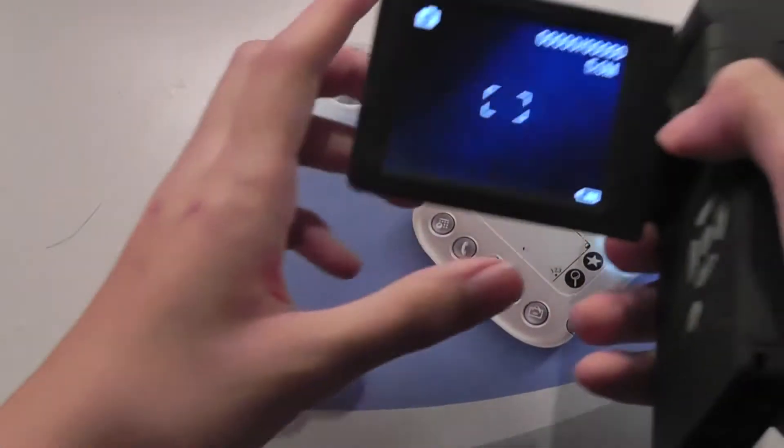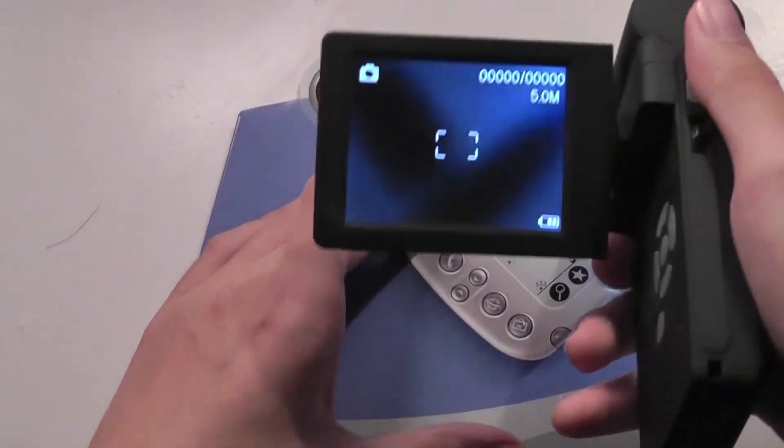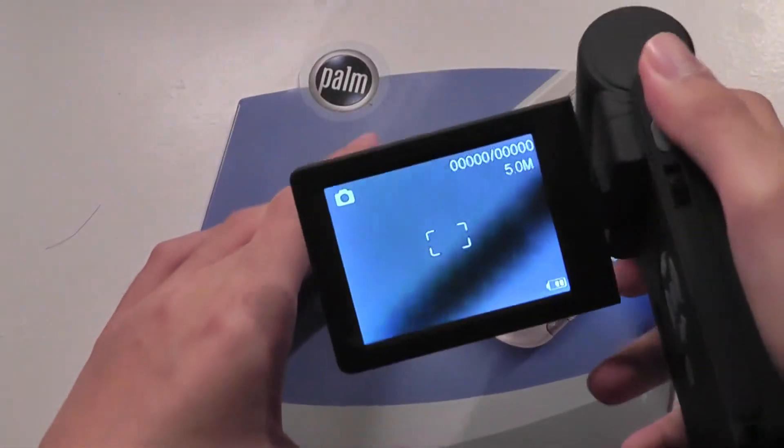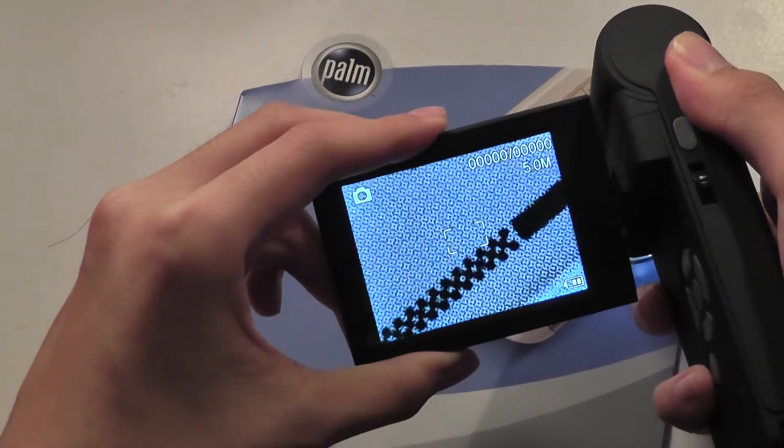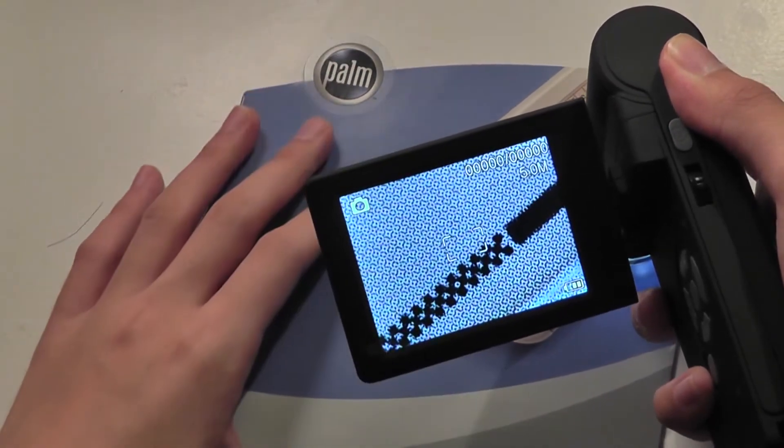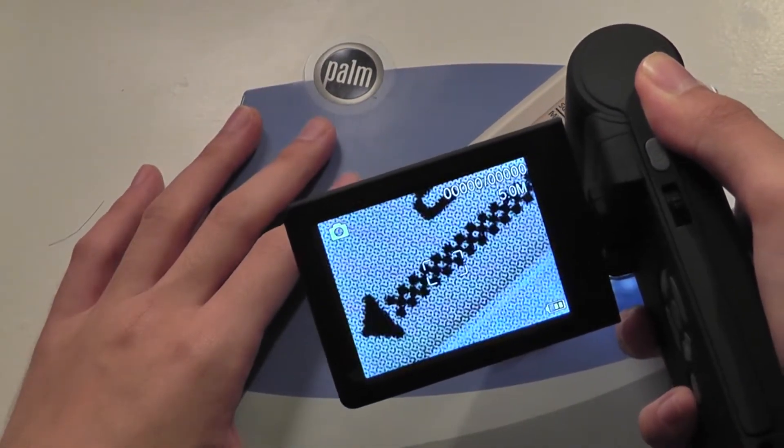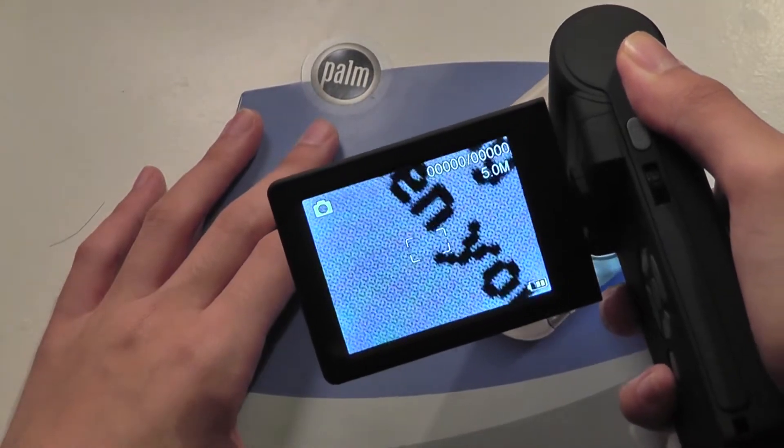We'll take a closer look at some printouts. This is an icon of a palm device. If we put it here, we can then zoom in and zoom out, and you can see the text can get pretty clear. You can see all the pixels on the screen, including how the actual paper was printed out, which is very impressive.